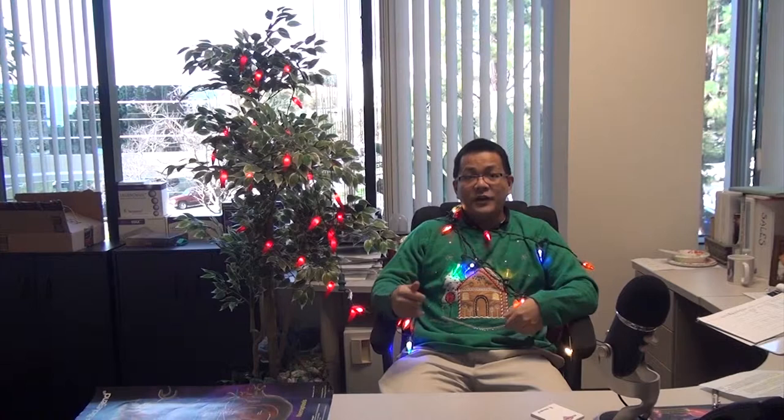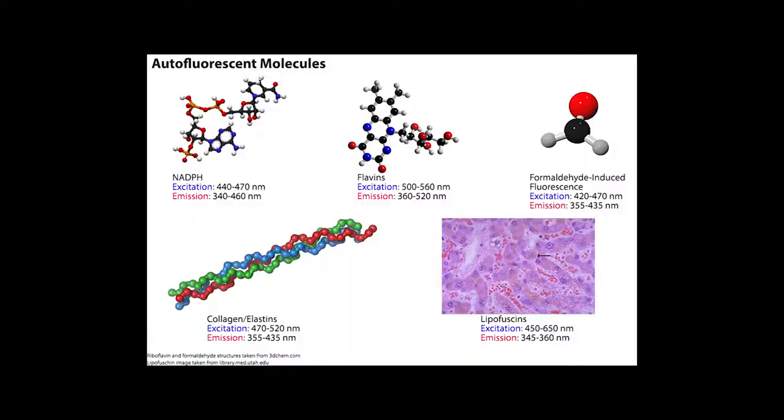You do have to consider this when you look at data, because there are actually a lot of molecules that your cells are making that contribute to autofluorescence, and you should look at it in your flow data. Let's take a quick look at this chart — you can see all the different molecules that can contribute to autofluorescence.